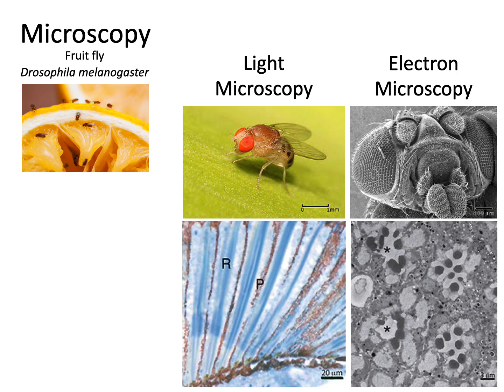And then just on the lower left, where there were histological stains to bring out the blues and the tans, electrons would generally just pass right through a thin specimen. So normally you have to apply heavy metals and different types of stains that'll make the regions variable in how electron dense they are.